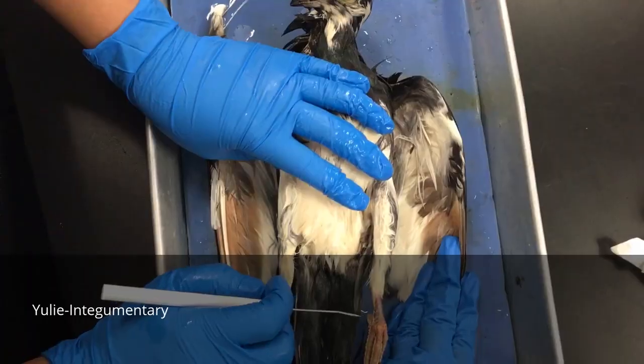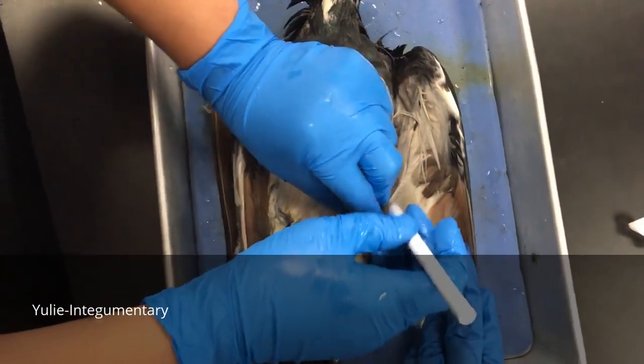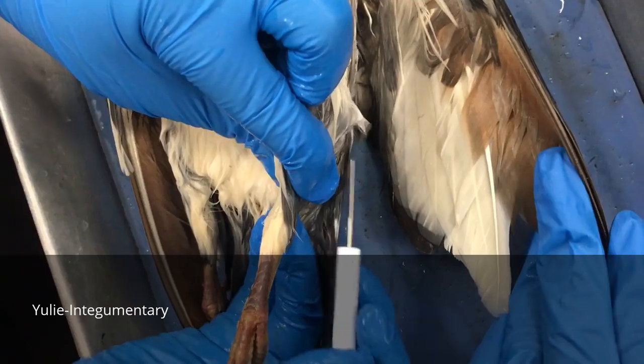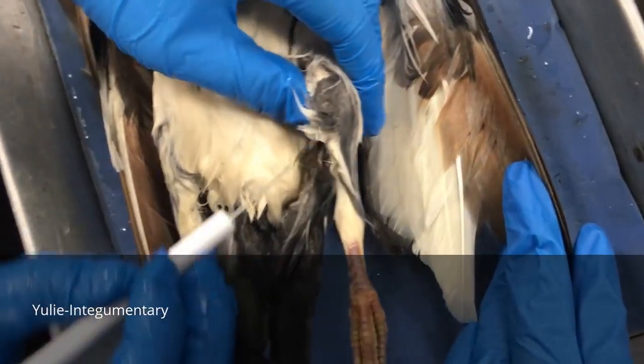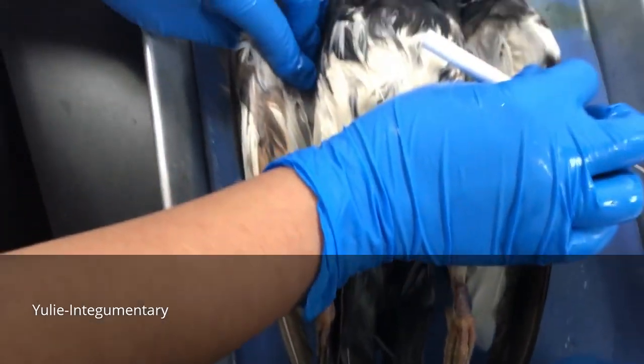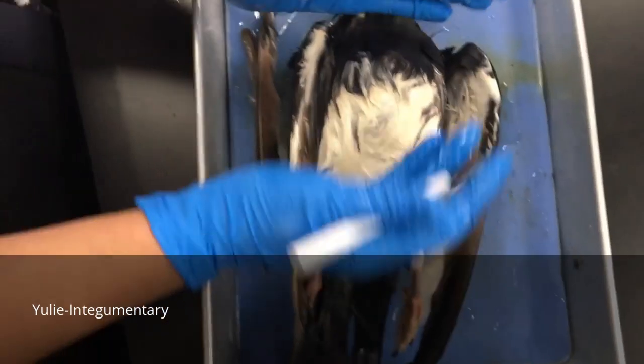So besides the feather, when he's walking, you can kind of see the flank. It would be his leg piece over here, the equivalent to our thigh, and his leg. This is his entire leg, his wings.